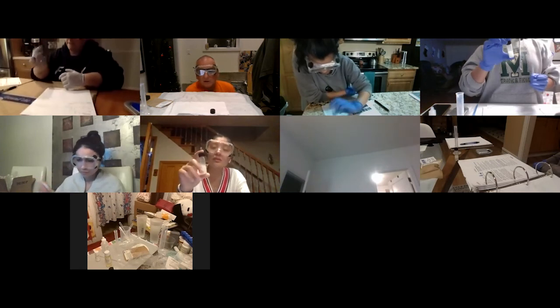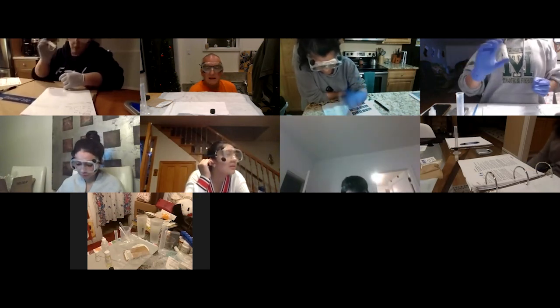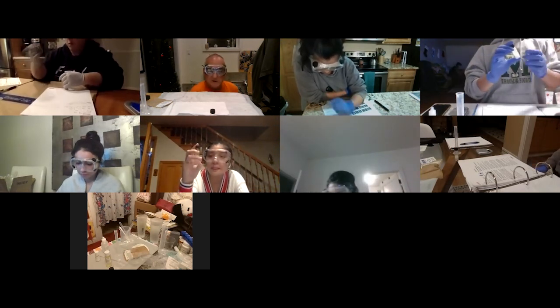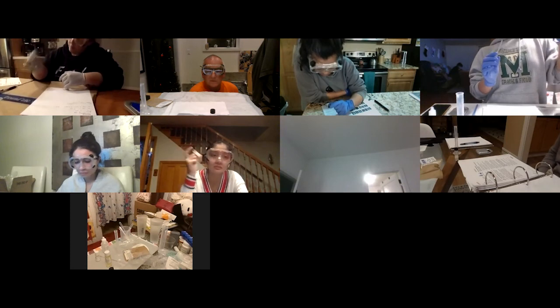It does seem to separate awfully quickly. So you could see why in industrial soap making, stirring and mixing would be so important. Because you can see these components do not want to mix with each other.